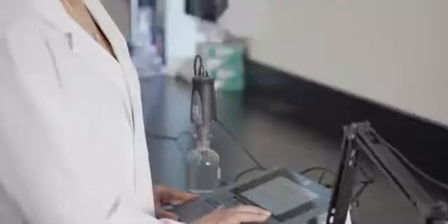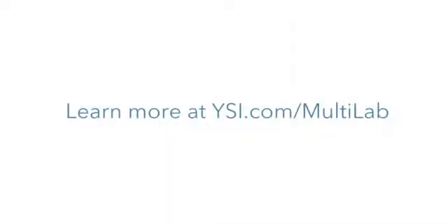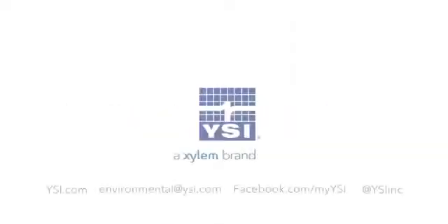Measure confidently and quickly with the full range of IDS sensors. Find out more at ysi.com/multilab.